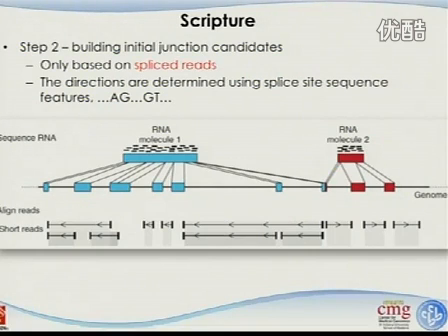And your second step will diverge a little bit. This is very straightforward. Okay, there is no equation, just a strategy. At this stage, they only use the spliced reads. Okay, they only use the spliced reads. This is the part I hate. Because we know it's hard to really do the splicing, the junction alignment is so hard. And sometimes we are missing things there, but at this stage, they only rely on those reads.